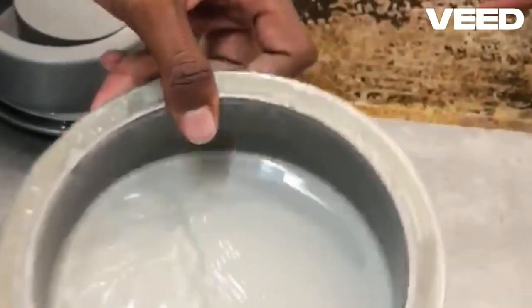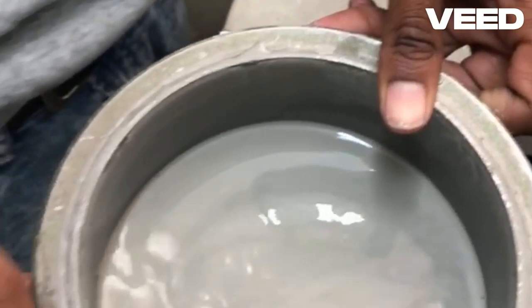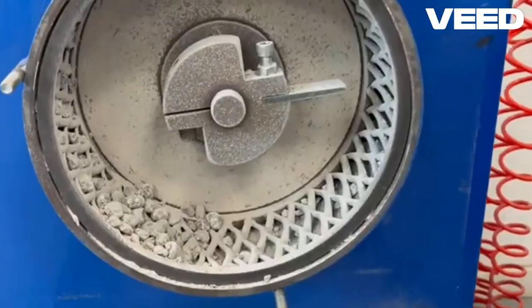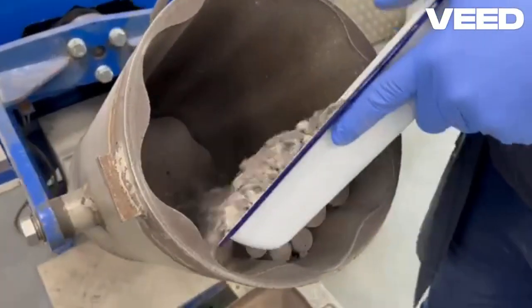After pulverization is complete, the pulverized sample is collected from the grinding ring for further analysis or processing. The sample may be sieved or separated to remove oversized or undersized particles, depending on the application.